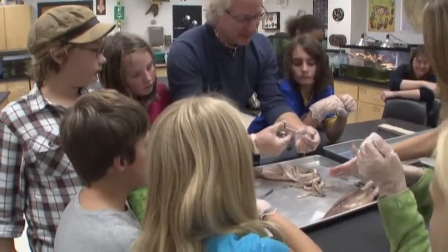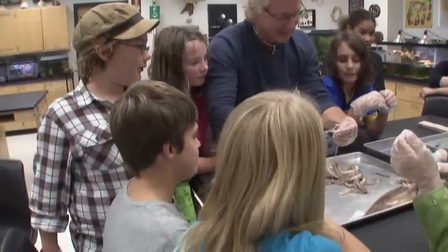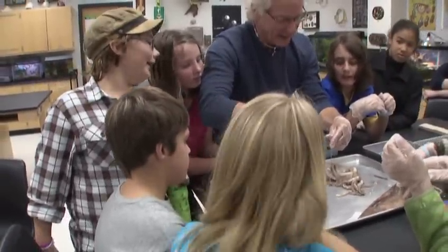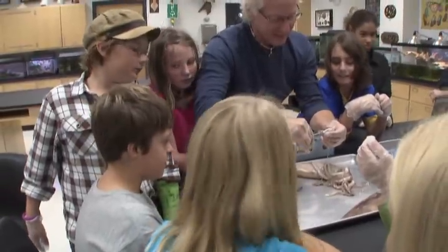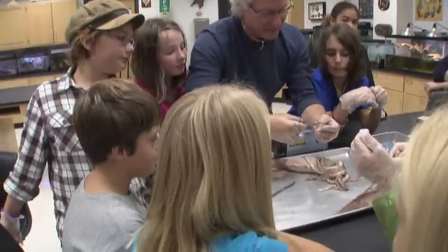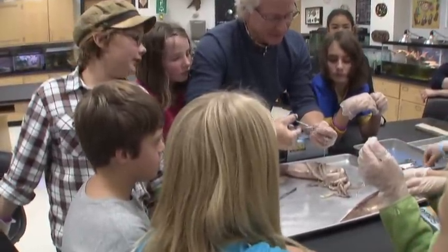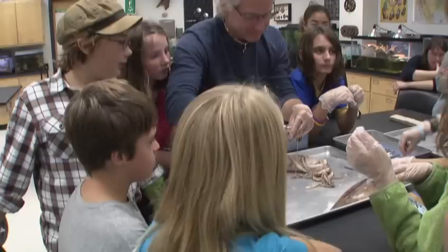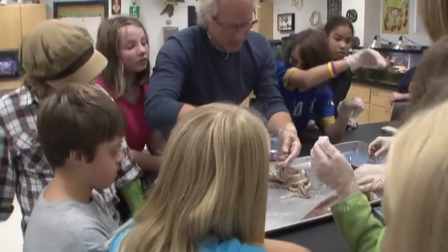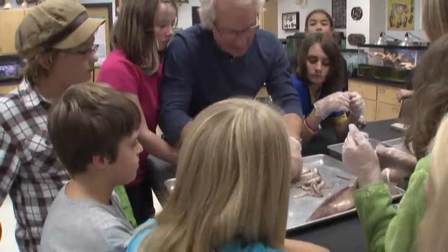So I'm going to cut this open here. Oh, sweet. So cool. This is the best part to eat. You fry this up. It's a little gooey. They have a lot of mucilage here to keep things functioning, as you might suspect. But wait till you see this beak here. That's a little stringy. Is that the esophagus? Part of it, and a part of the muscle that attaches to it.